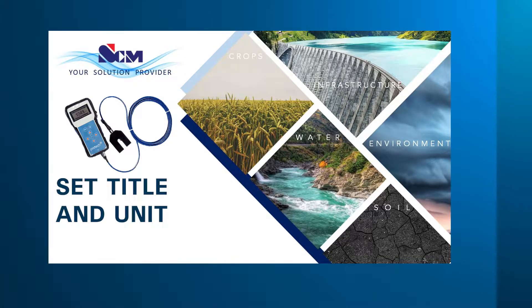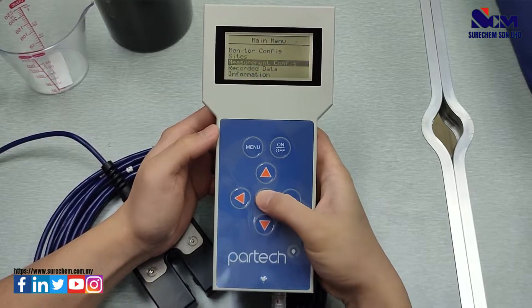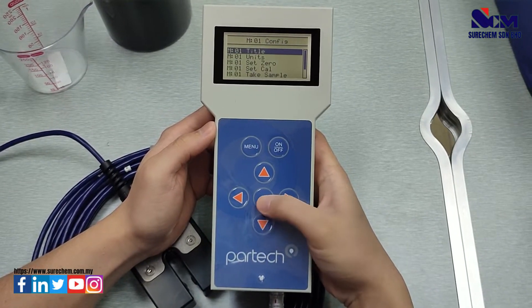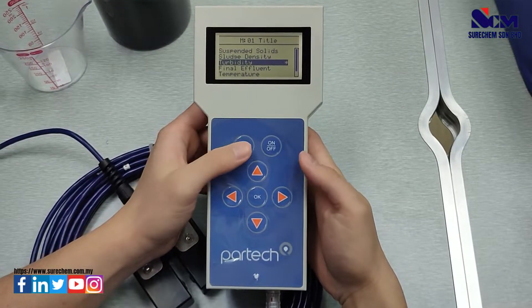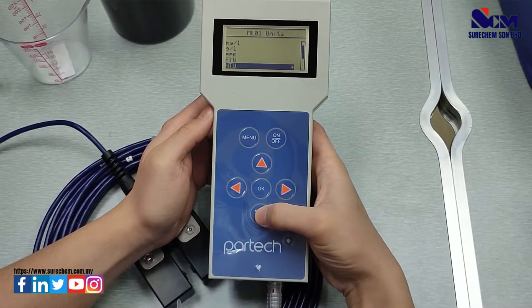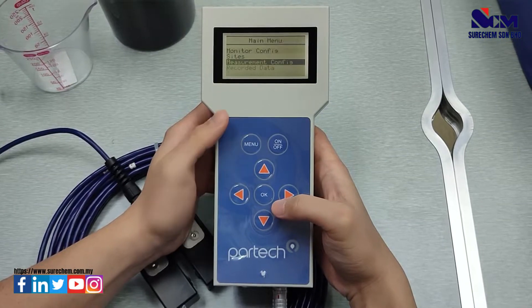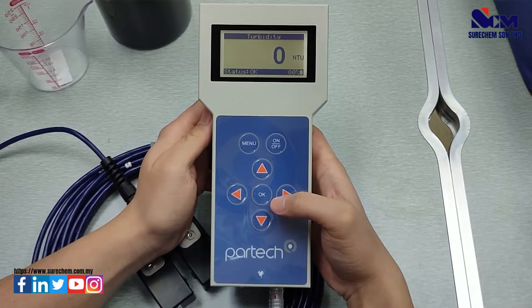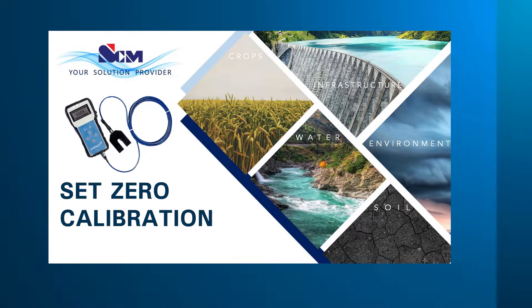Move on to select the site. This step will teach you how to set the title and unit for turbidity. Go to the menu, go to Measurement Configuration, select Title, and select Turbidity as the title. Then go to Units and select NTU.